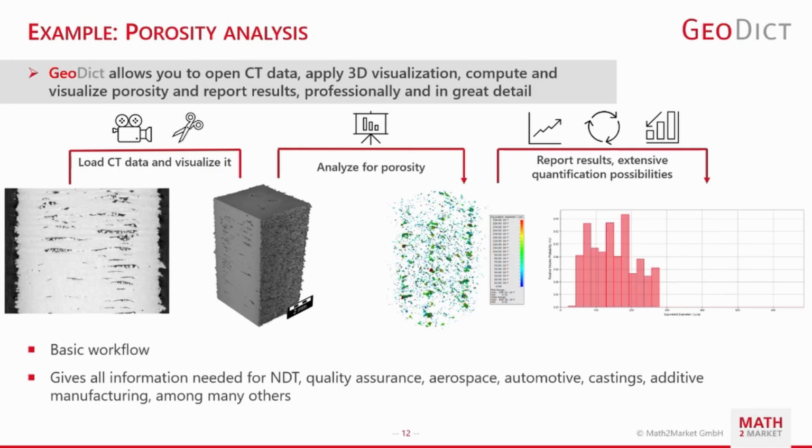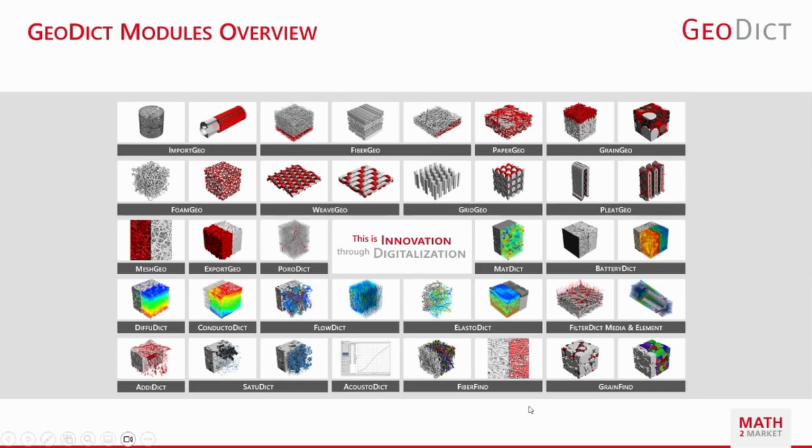And one example is porosity analysis, which is the topic for today's seminar. And here is an example of this. You have a sample with some internal pore spaces. These are then segmented quite easily and analyzed automatically, giving you a nice 3D color-coded image and statistical plots, which you can save to images and to reports. And this is what we will show you today in the live demonstration to reach this result.